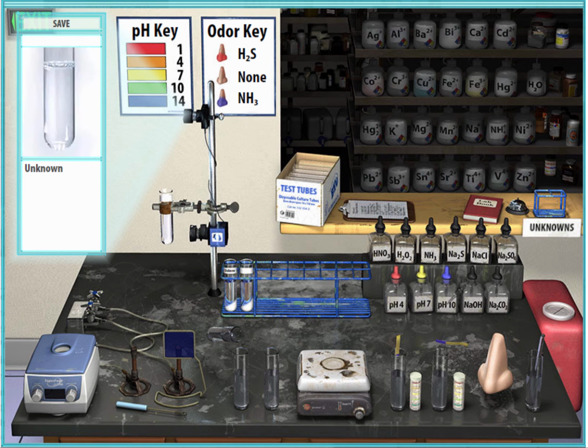Now we'll come up to 10 and look for the magnesium. There isn't any magnesium, and so now we'll add the carbonate. Doesn't look like there's any calcium either, so I think we're okay.